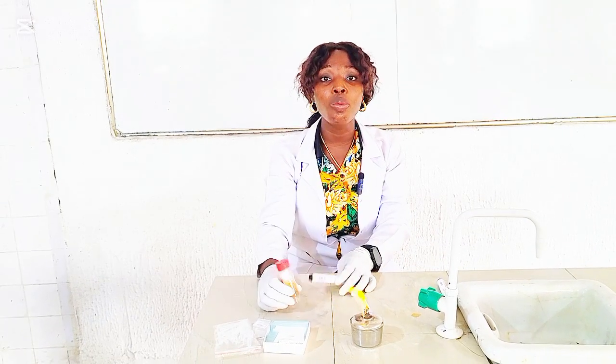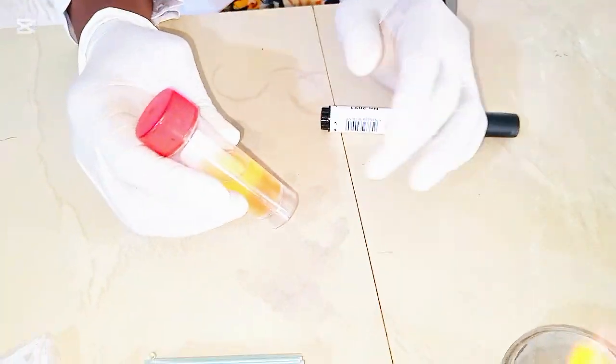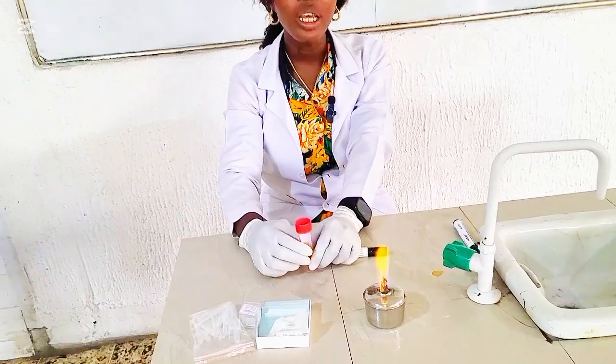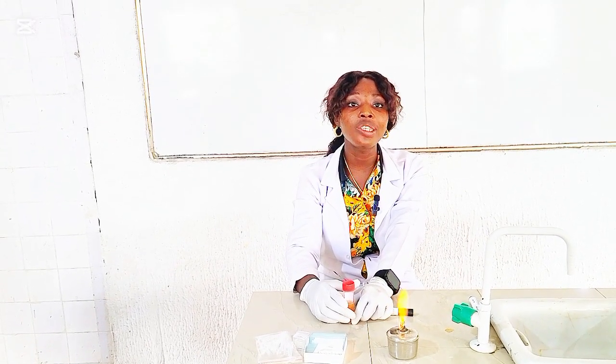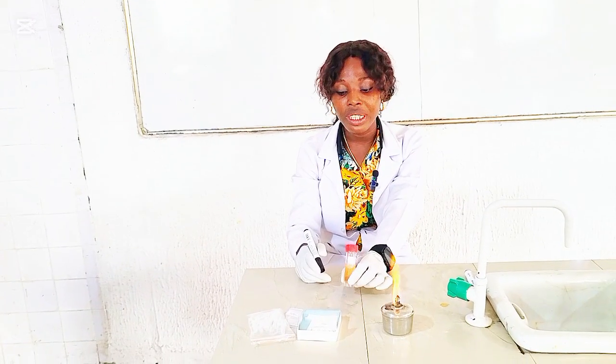So when urine comes to the lab, it goes through different processes of registration. We're not talking about culture today, but if the urine is meant for culture, it should be early morning midstream urine, the first urine in the morning. We have several types of urine samples, which we'll talk about in our subsequent videos. But for today, we're talking about the microscopy of urine sample.